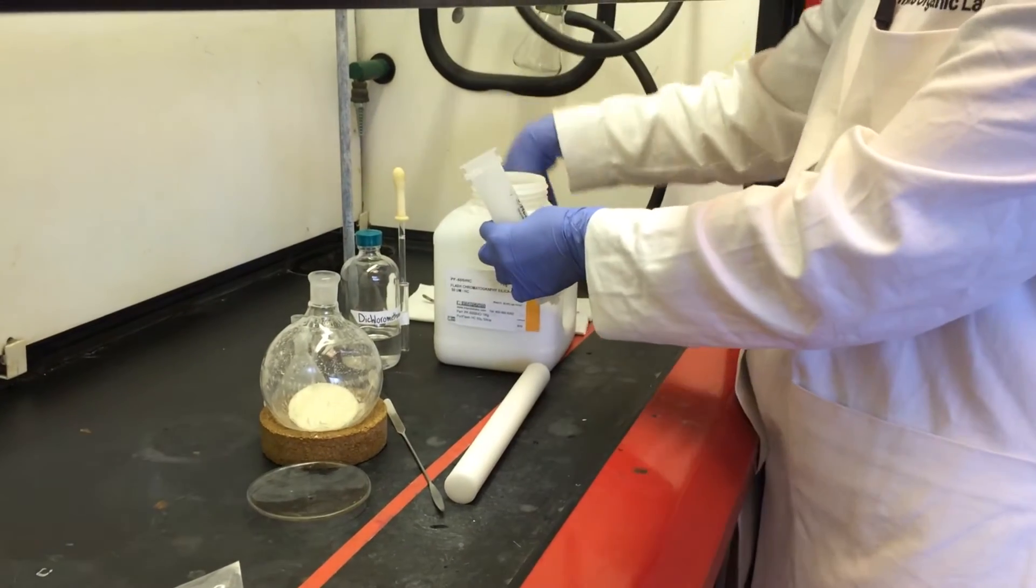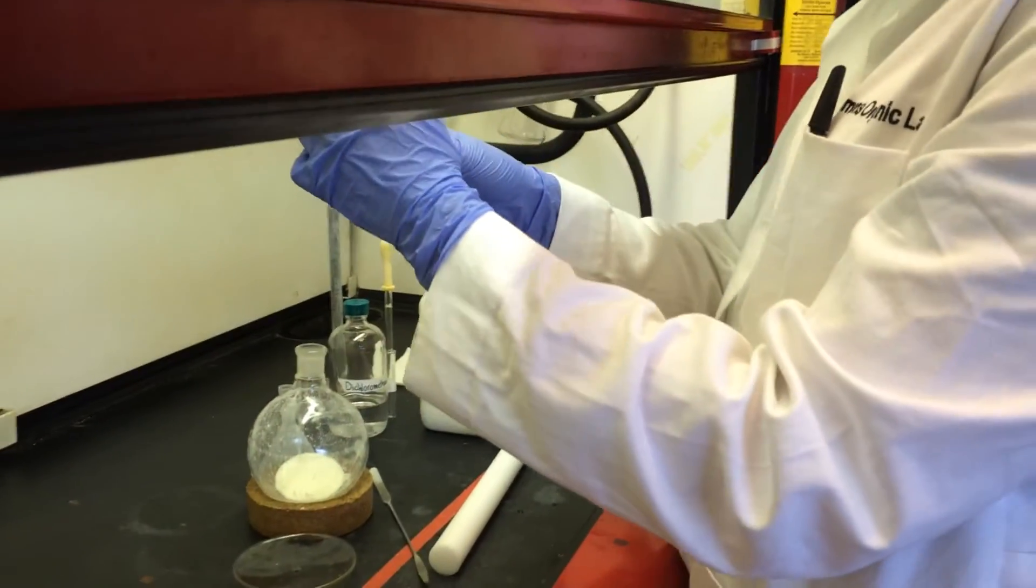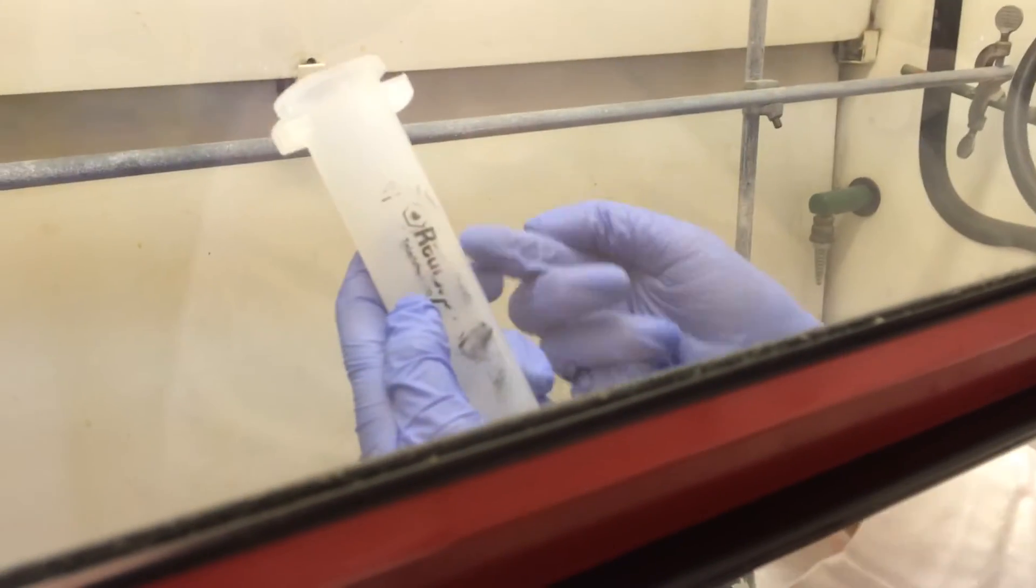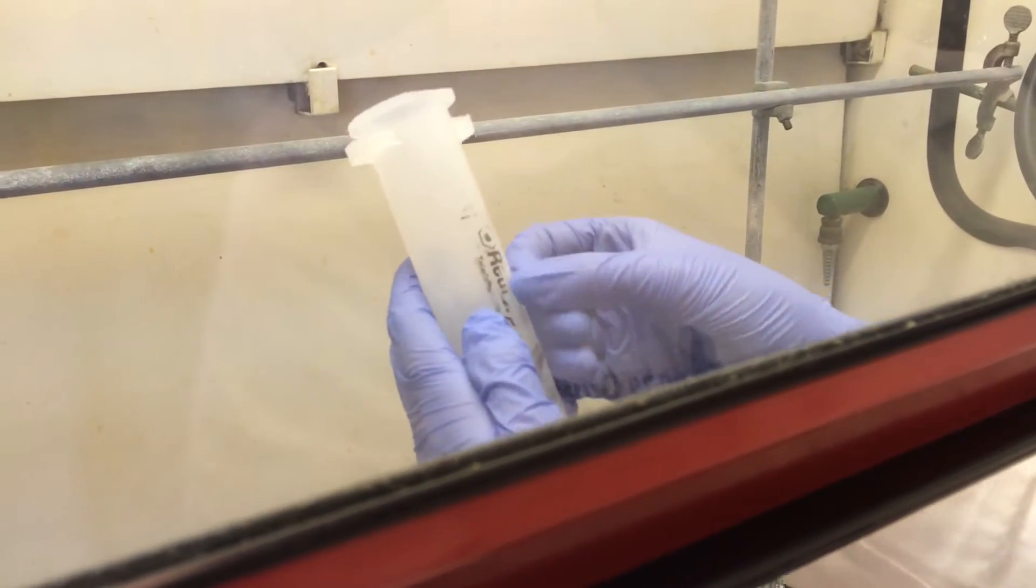Next, you pour in some silica gel until about halfway. Normally, it will be between the I and the S. This cartridge is missing some of the letters, but normally it will be between the I and the S.